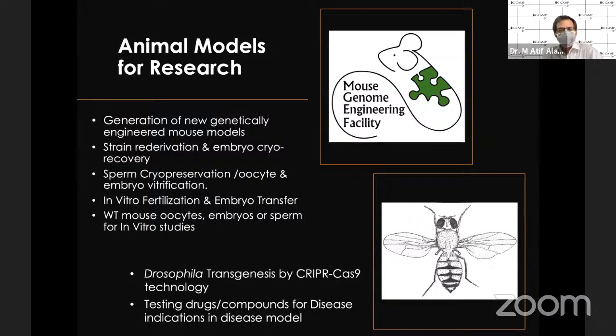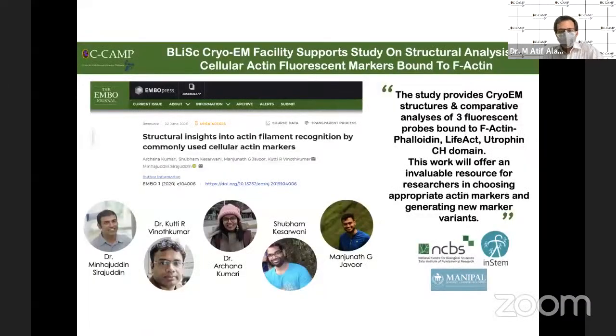And I'm excited to have the heads of these facilities, Dr. Aurelie and Dr. Deepti, to share the most exciting work that we are doing, particularly on the genome engineering aspect using largely CRISPR-Cas9 methods. Before I hand it over to my colleagues for giving you a detailed presentation and also take your questions more importantly, just a glimpse of what work has come out of these facilities.